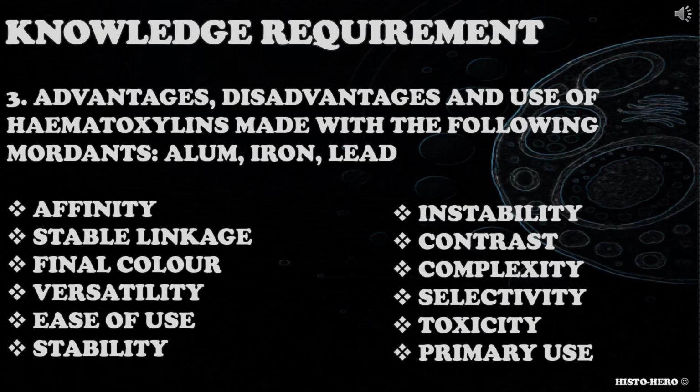When addressing this knowledge requirement, candidates should consider affinity, stable linkage, final color, versatility, stability or instability of use, primary use, contrast, complexity, selectivity, toxicity, and so on.